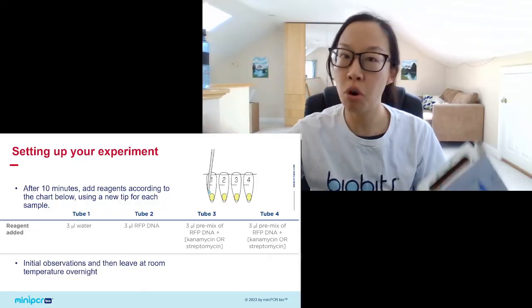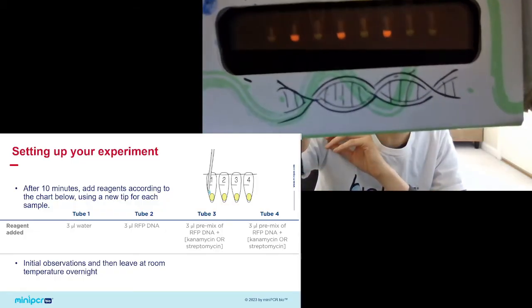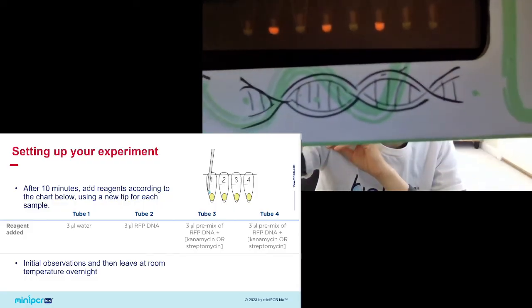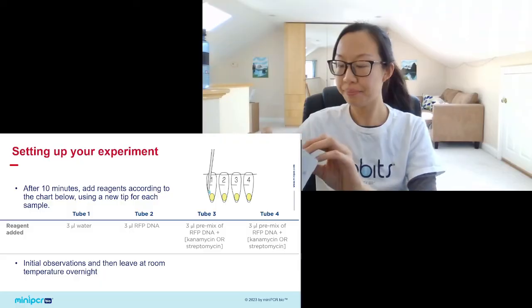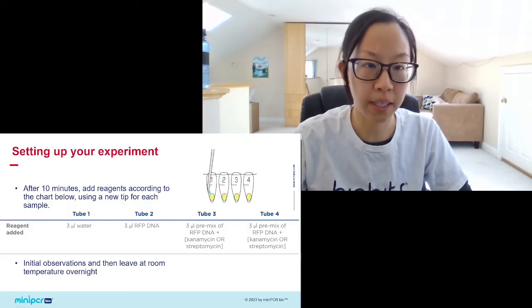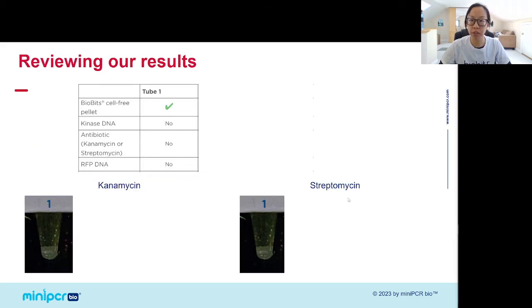So we can actually go through tube by tube and see what's going on. But again, this is something like what you students will see, bright red fluorescent protein. Pretty cool, right? All right, turn that off. And I'm going to switch back to my slides a little bigger. All right, so let's recap what we just saw.